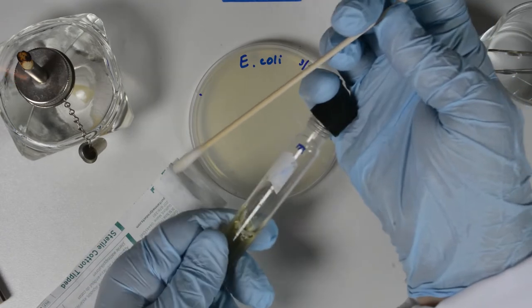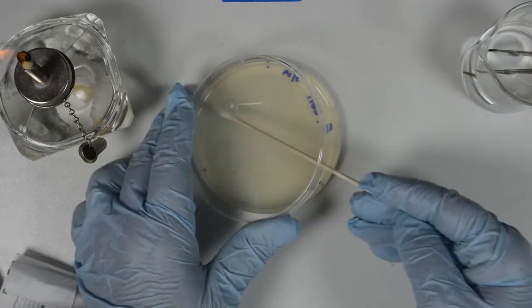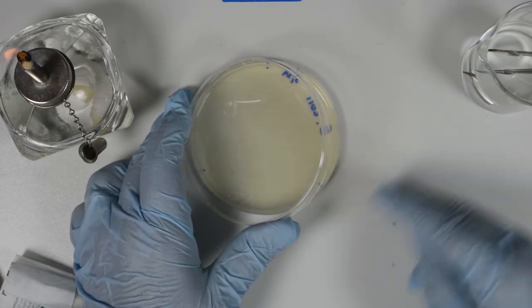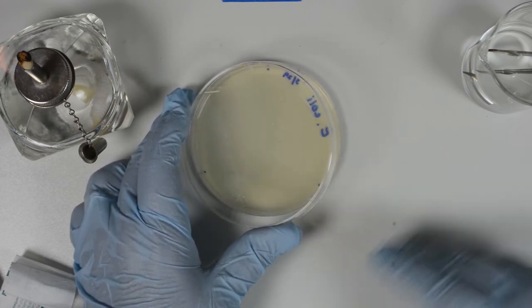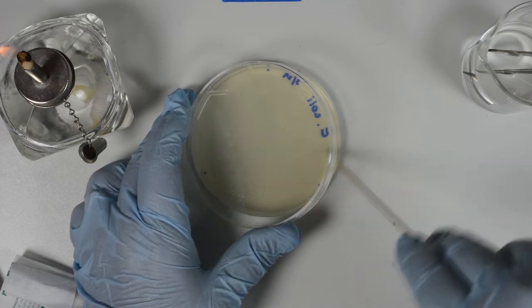Press the swab against the glass inside the tube to remove excess liquid. Lift the lid of the plate only enough to be able to insert the cotton swab — do not take that lid off. Take the swab and cover the surface of the agar evenly by moving in both directions, making a tight zigzag.